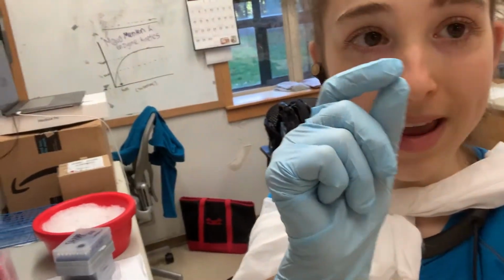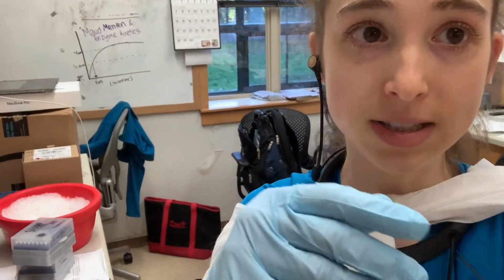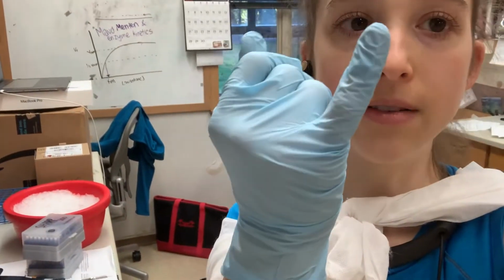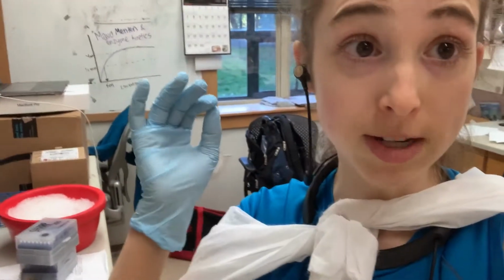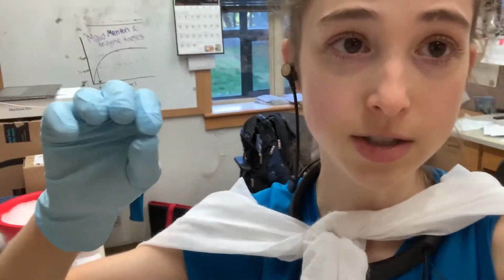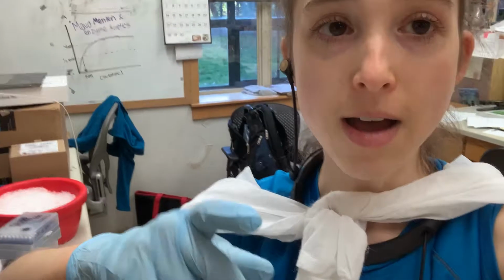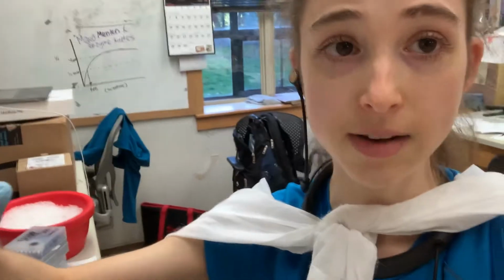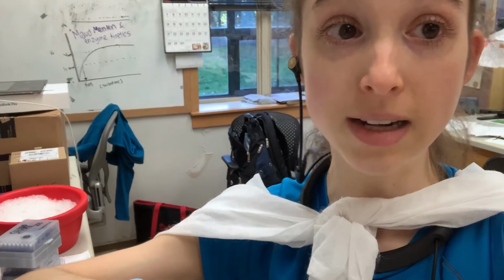You wouldn't want to weigh out a teeny tiny weight of something, because then you have higher inaccuracies. How accurate would a difference of 1 drop of water be if you were measuring out a teaspoon compared to if you were measuring out a swimming pool? It's a much bigger difference. And so when you're making these high concentration solutions, if you're a teeny bit off on your measuring, it's not as big of a deal as if you were measuring a really tiny volume. So making these solutions ahead of time helps to reduce the errors and keeps you from having to add really tiny amounts of stuff.